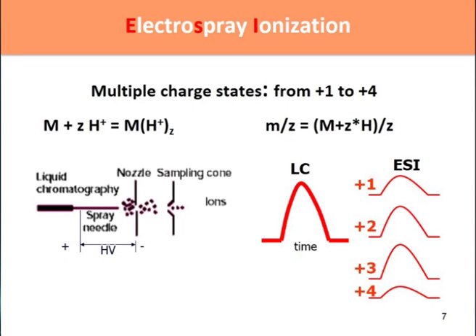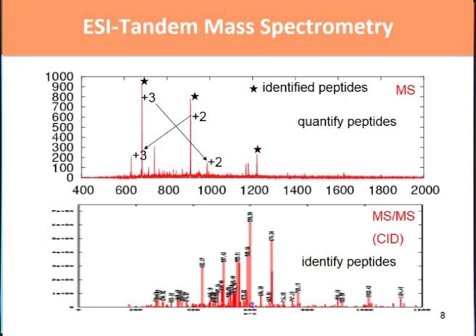Ideally, you want to take advantage of all those, so you want to keep that in mind as well. What you can do is this: again, this is the MS1 as it's eluting. Could be that this very large peak got fragmented. The instrument decided to do CID on this, that's the star, and confidently identify the peptide, and it knows the mass and the charge state.